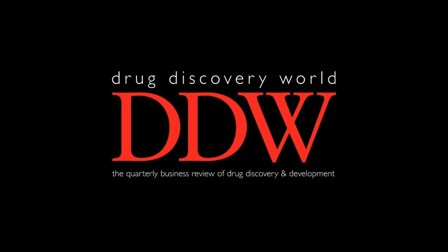This article was written by Luke Hickey. Luke Hickey is Senior Director of Biomedical Sciences at PacBio. At the time of authoring this article, Luke led development of PacBio's single-molecule long-read sequencing technology in the human genetics research market. In this role, he has contributed to the development of novel genetic analysis methods and applications of the technology, including the full-length transcript isoform sequencing Iso-Seq method.